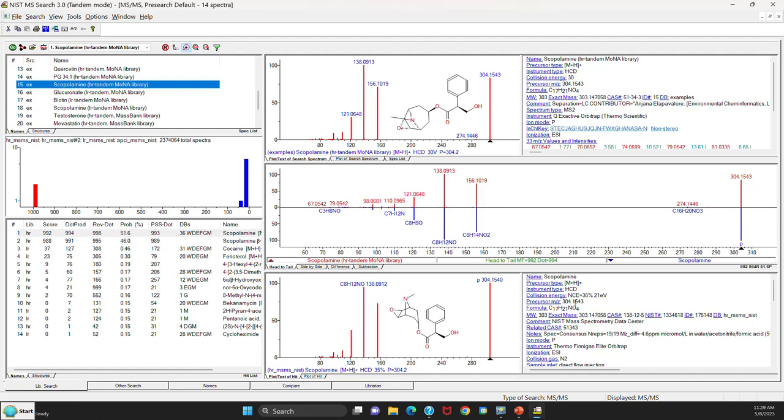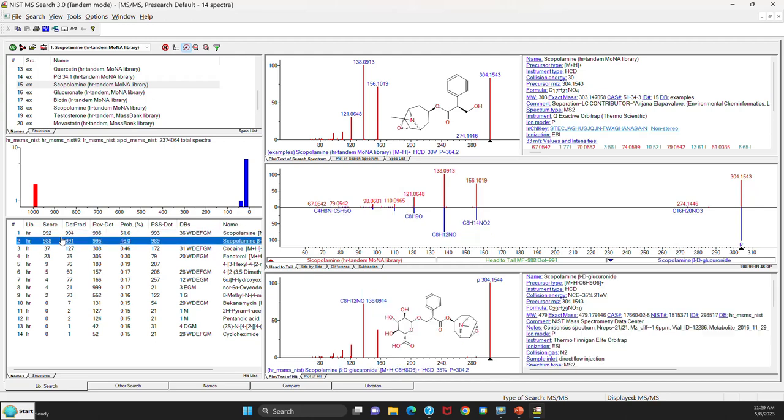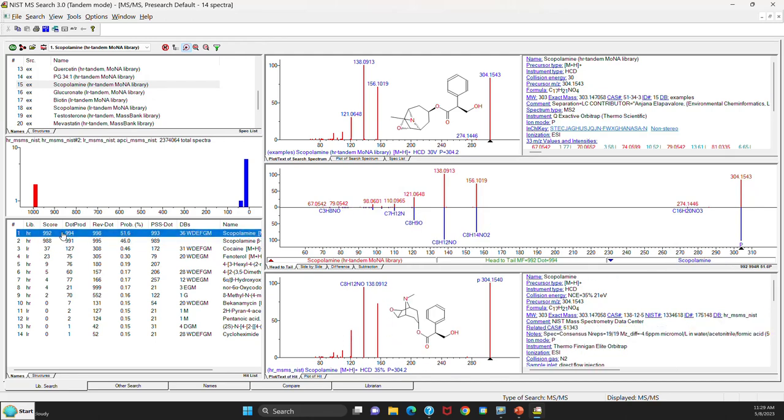So if you go over to the score, you can see it's about 992. So it's a good fit for the compound. So that's likely what it is. Pretty much the same as in the version 2.4 in that regard.